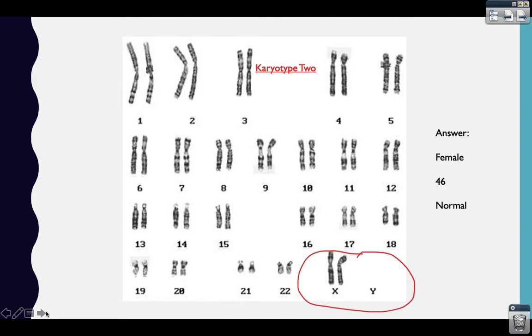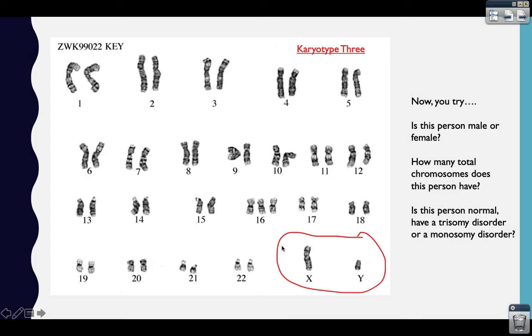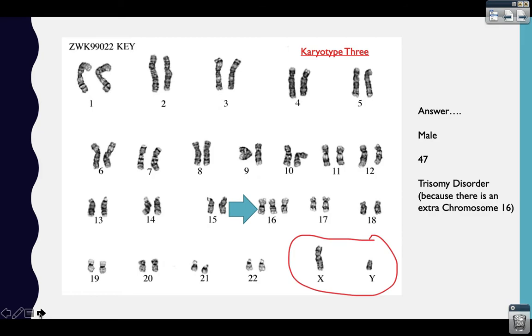Now we're going to try it one more time. Here's our third karyotype. Figure out first if this person is male or female, count the total number of chromosomes, and determine if this person is normal, has a trisomy, or has a monosomy disorder. Pause the video, figure it out, and when you're ready to check your answer, resume the video.